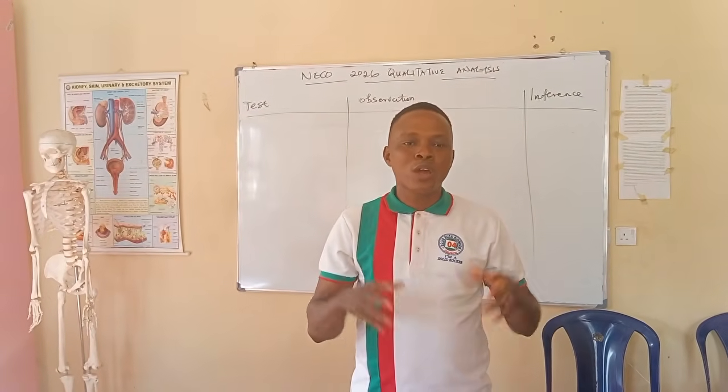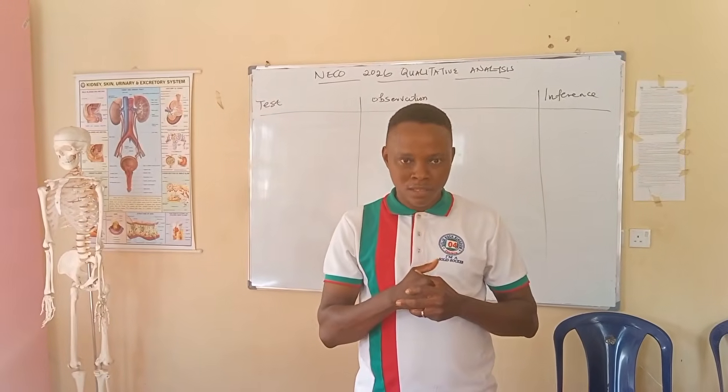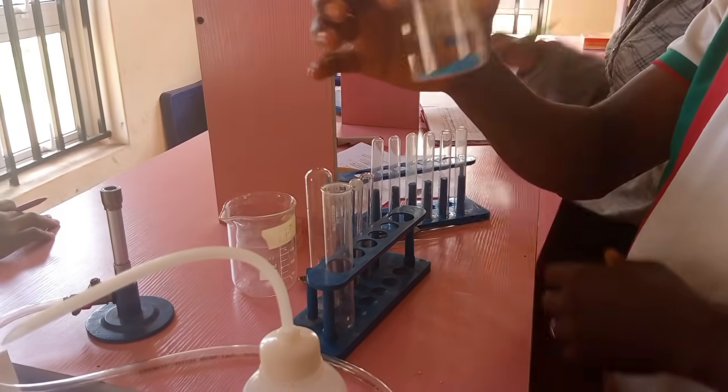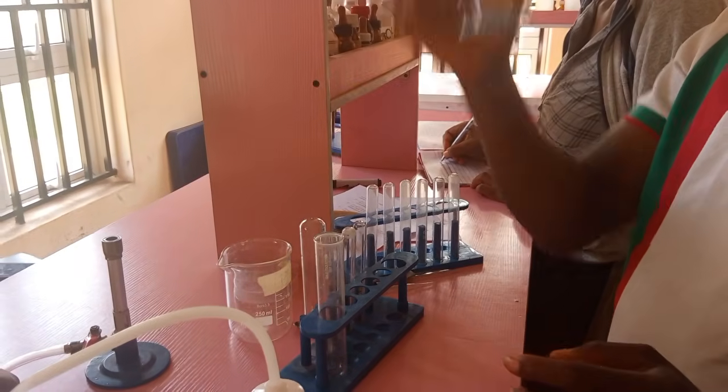In today's class, we are going to be working on the NECO 2026 Qualitative Analysis. Stay calm while we carry out this test. It's copper(II) tetraoxosulfate(VI), and we are going to be carrying out this experiment.